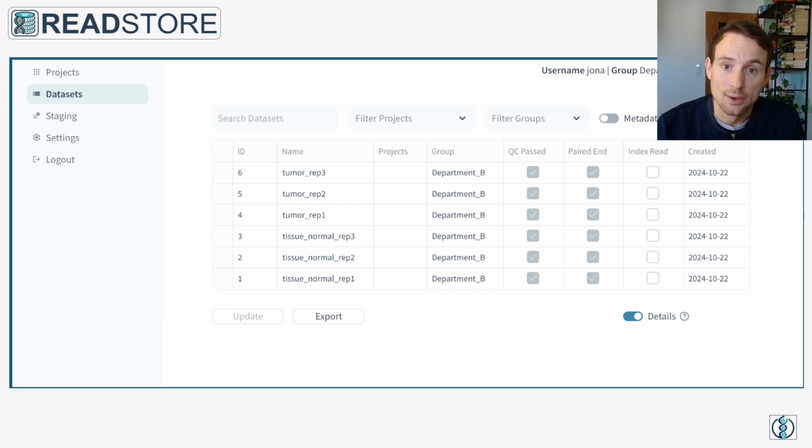What we'll first look into in this video is a quick start tour of how we can create a project and assign datasets. And then in the second part of this video, we will take a very detailed look into the different options for creating the projects, datasets, and how they are structured.